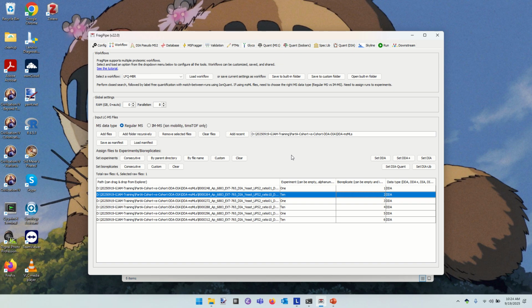So they might have a well-watered turf in which they were growing their plants, so they might have drought-like conditions, and they might have 2 different species that they were trying to compare differential responses in. In a case like that, you definitely do need to do a multi-factor study. But in this case, we're just doing a bunch of A versus a bunch of B, or a bunch of 1 versus a bunch of 10s. Any questions before we move ahead?